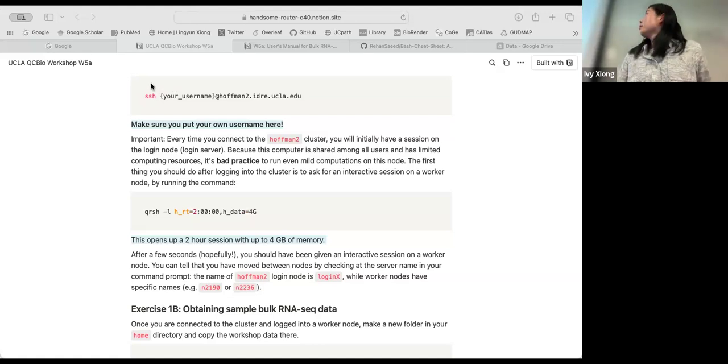Okay, so I will be trying, and let me try to log in. So that's how it looked when you try to enter SSH, and then it will ask for your password. So you type it in there, and then hit enter, and that's the home page. So we're here, right? So we logged in successfully.